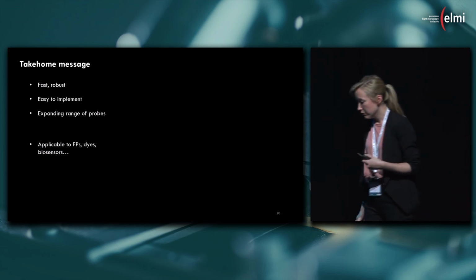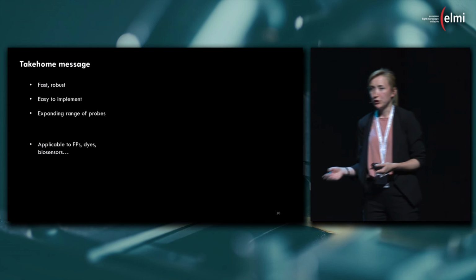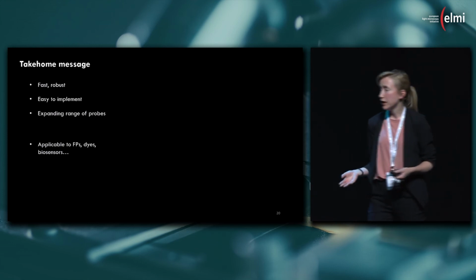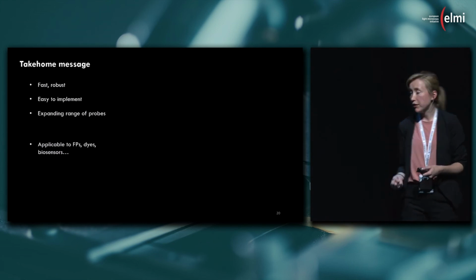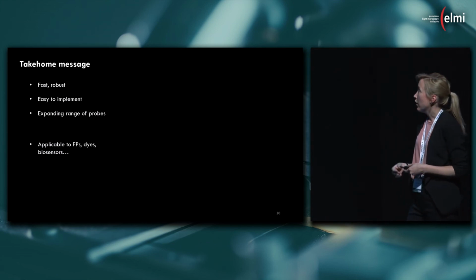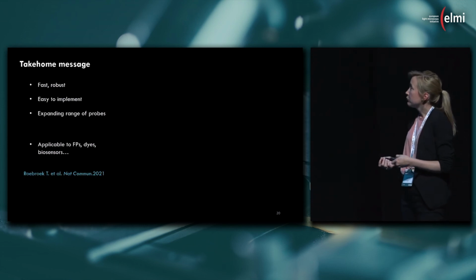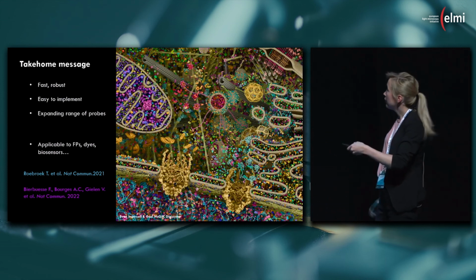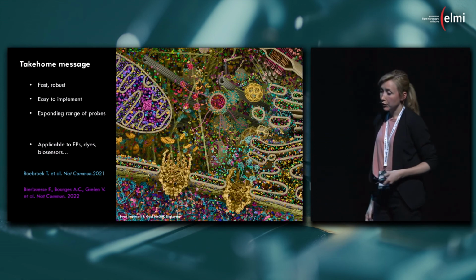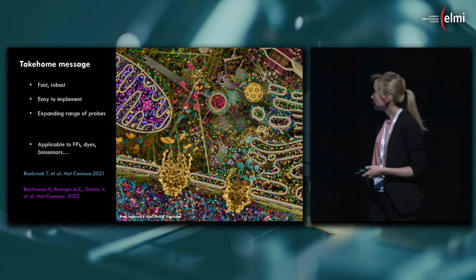This is an application which can go a bit deeper, meaning that we can use it not only for fluorescent proteins, but also for organic dyes or even for biosensors. And I would like to make a little reference to the research we do in the Turku lab, that we developed recently in these 2 publications of Tess and Franziska and Anais: biosensors which are photochromic, that they can be switched on and off.